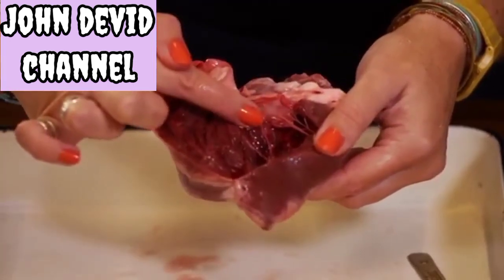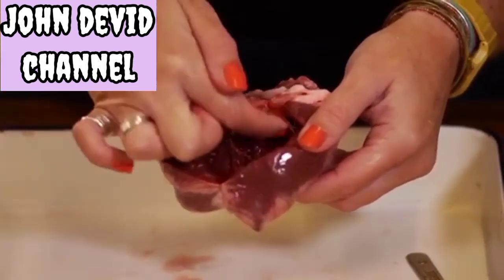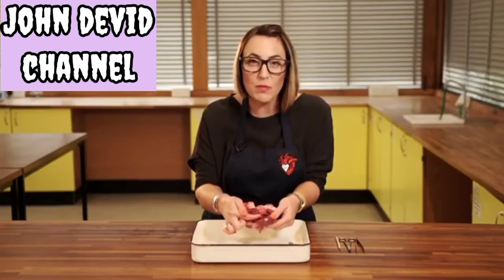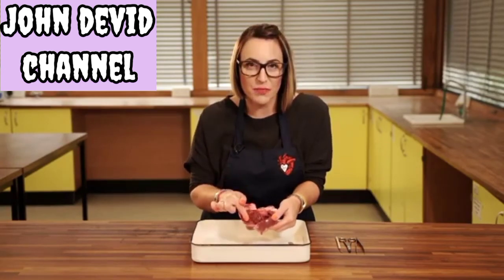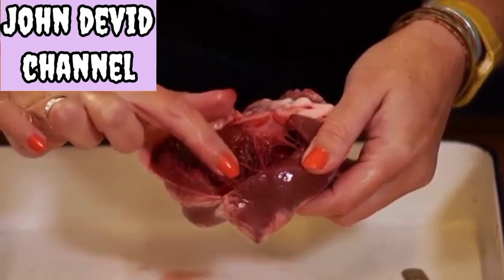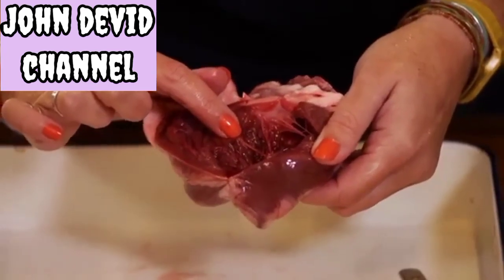When looking inside the ventricles you should be able to spot a couple of extra things. Here we've got a valve — these are really important because they make sure that blood is only pumped out of your heart, stopping the blood from falling back in against gravity. These valves need their own little muscles, and you should just be able to make out down here the muscles that are in support of those valves. These are our papillary muscles.